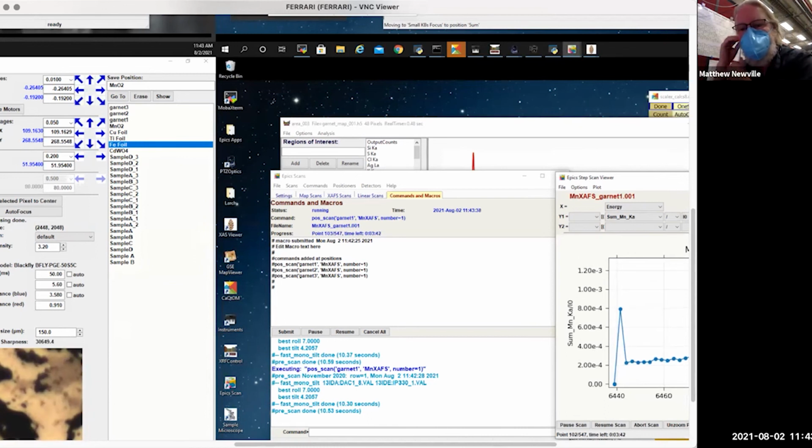The question is, is this technique available to combine with time resolution, for example, as a reaction procedure? So for time resolution, it's only a question of what time scale you need.